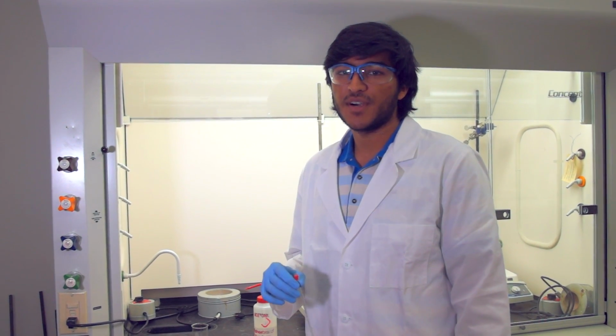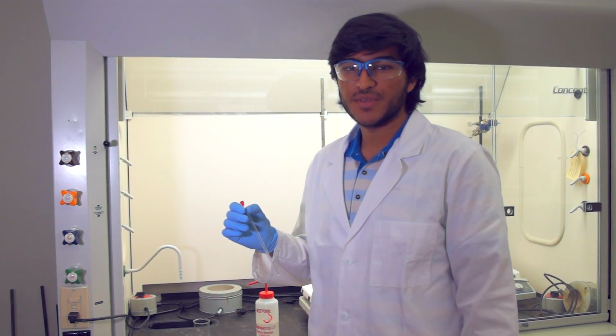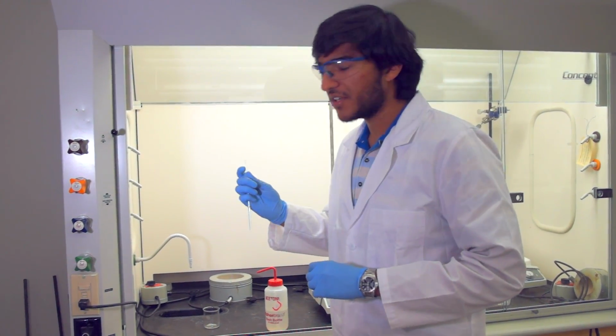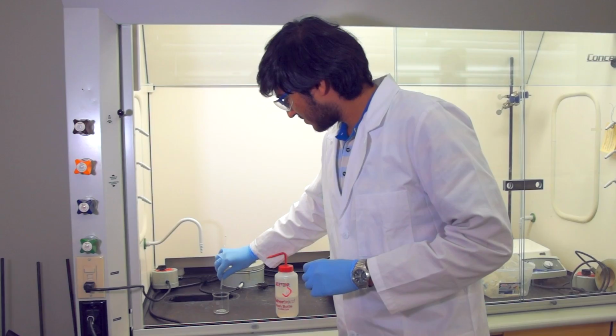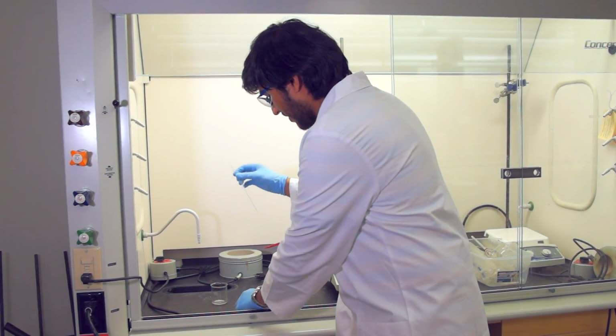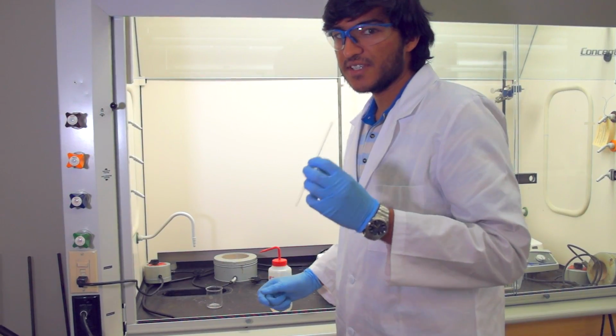Now that we've run our NMR, we need to clean out our NMR tube. First, I'll take the sample and put it into my waste container. Now I'll just rinse out the NMR tube with a little bit of acetone.